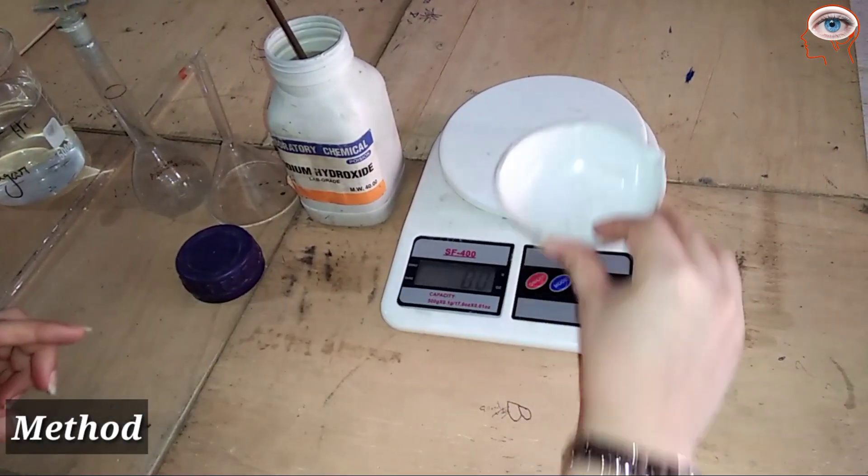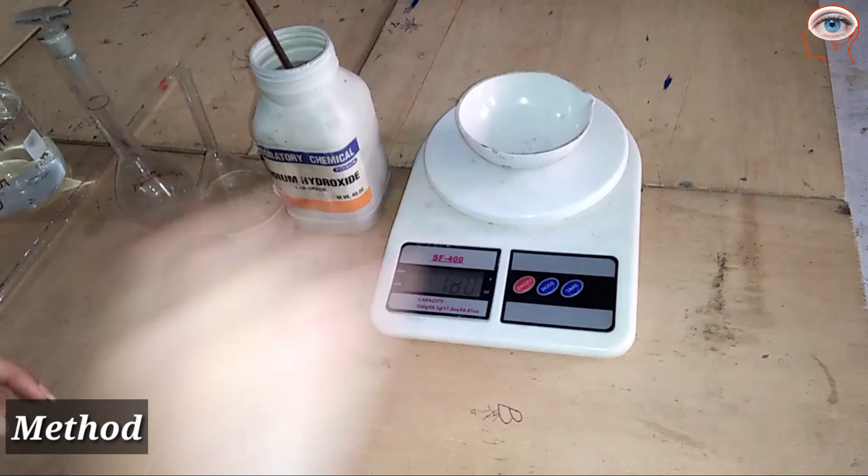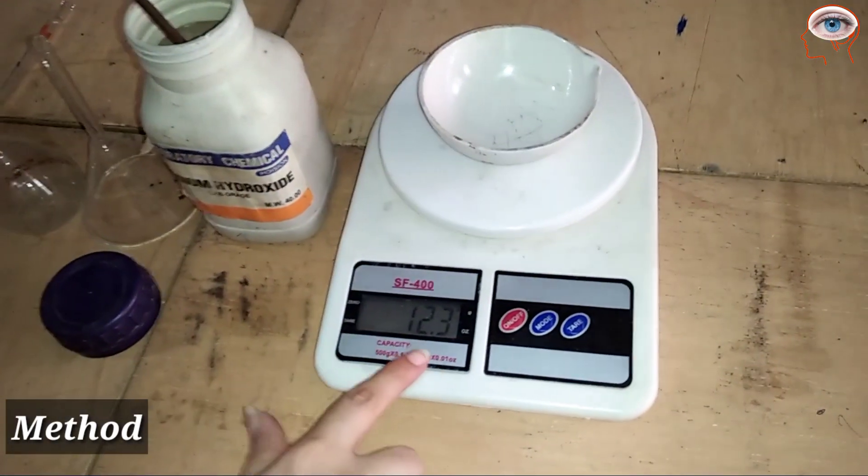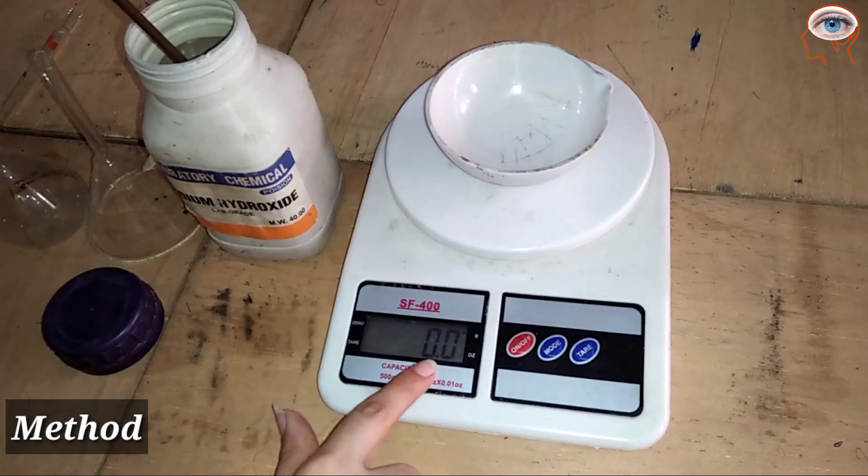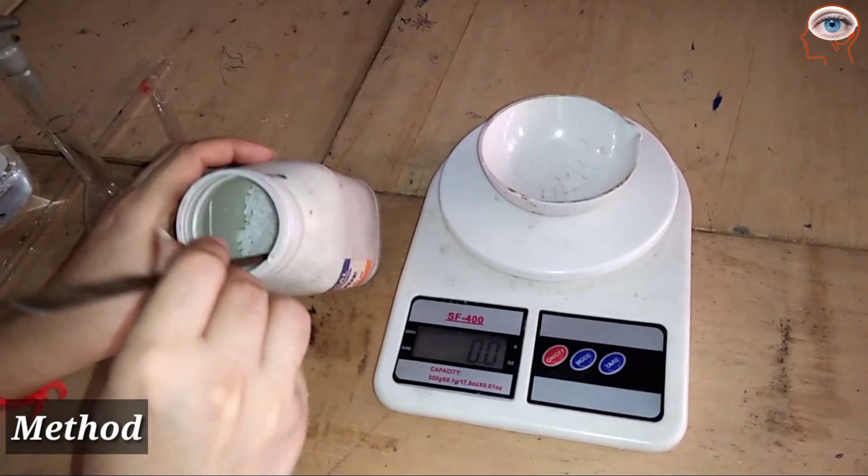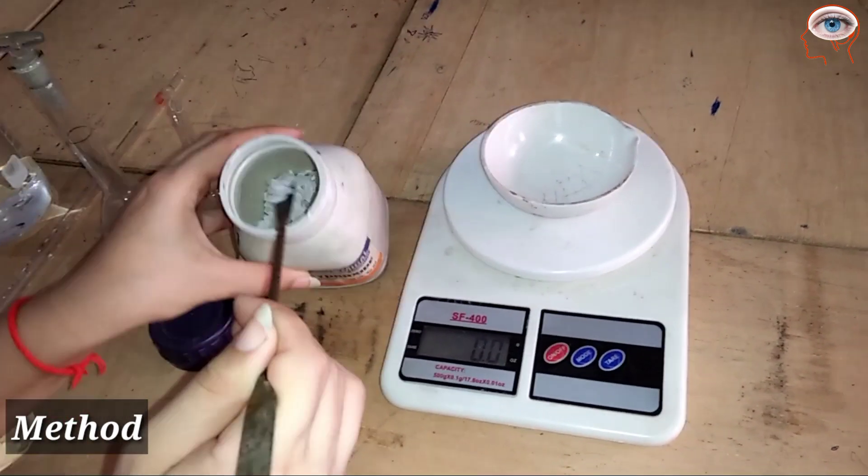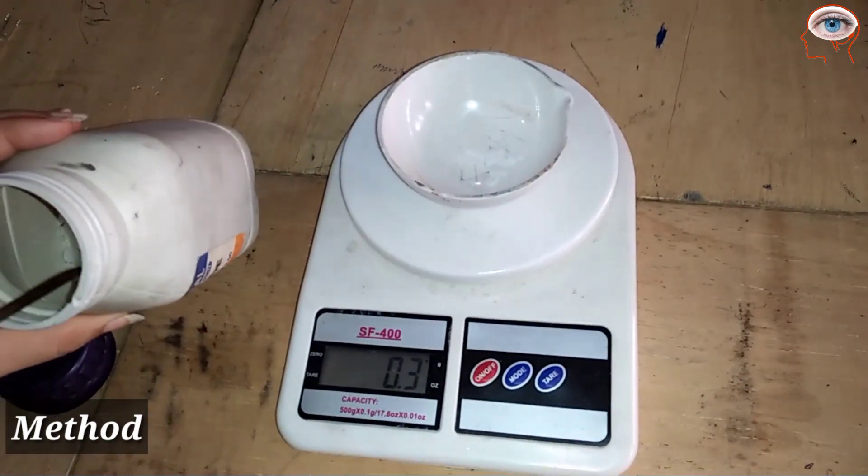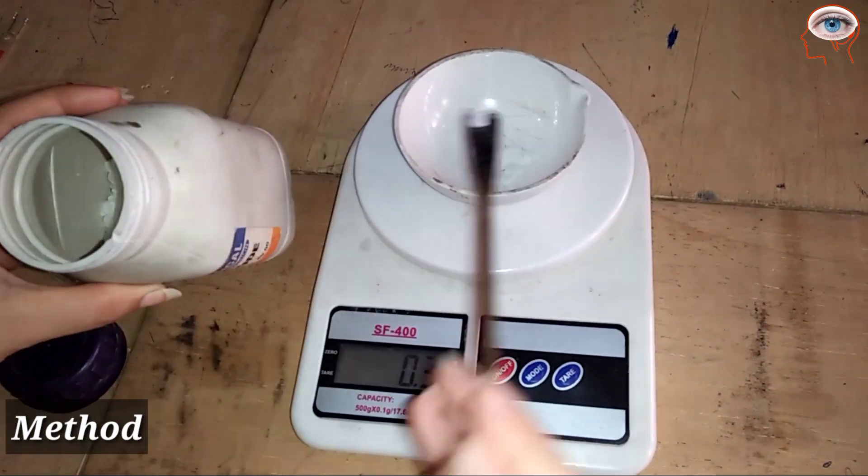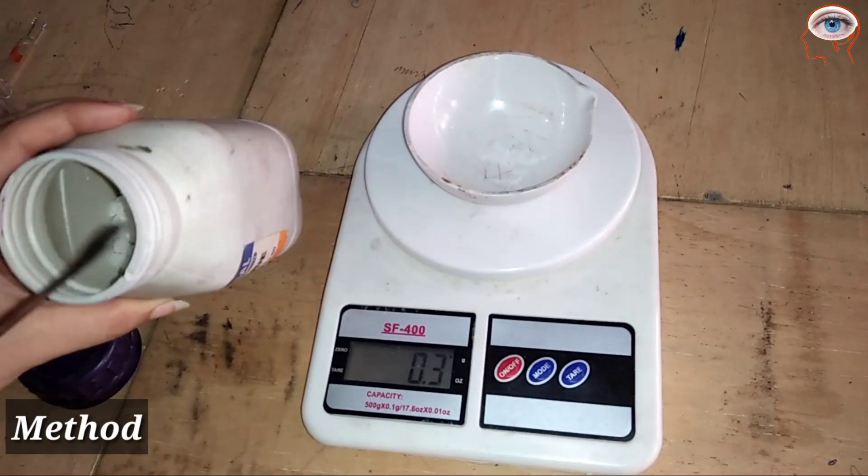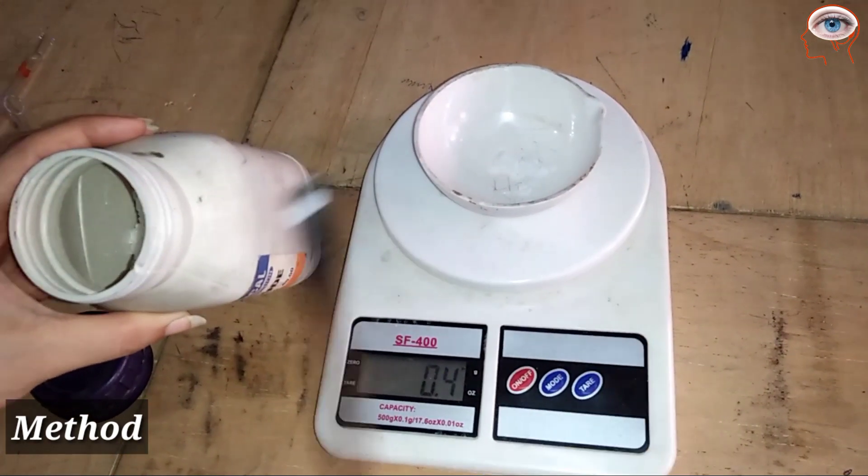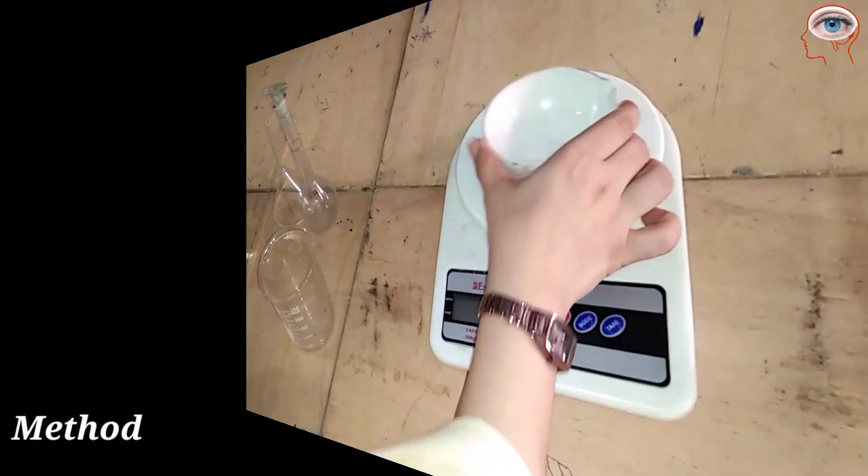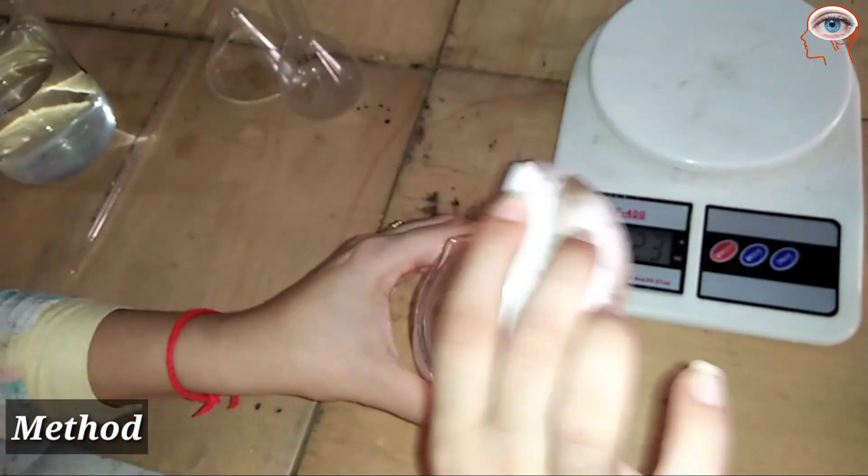First, put the china dish on the electrical balance. Press the tare button to zero out the weight of the dish. Start adding solid sodium hydroxide until the balance shows 0.4 grams. Continue adding until you reach 0.4 grams.